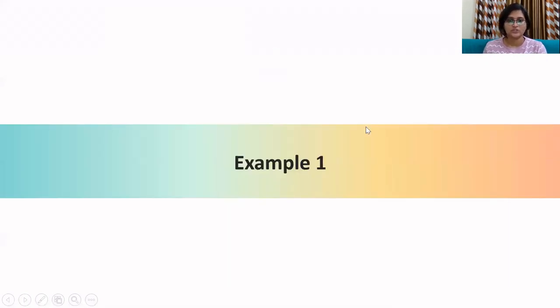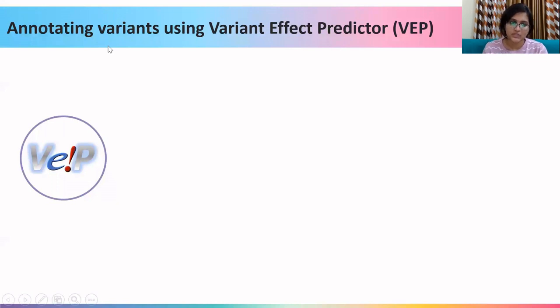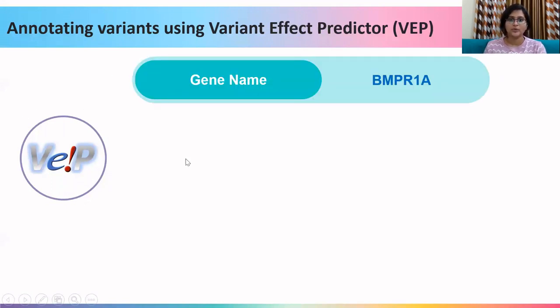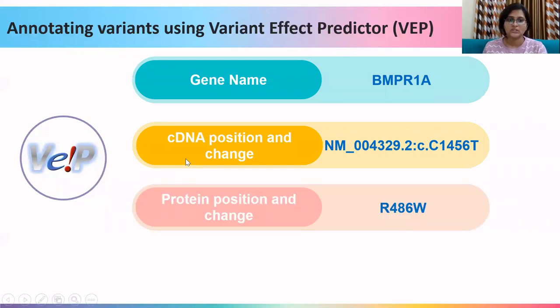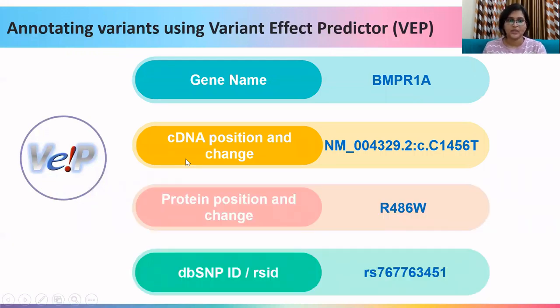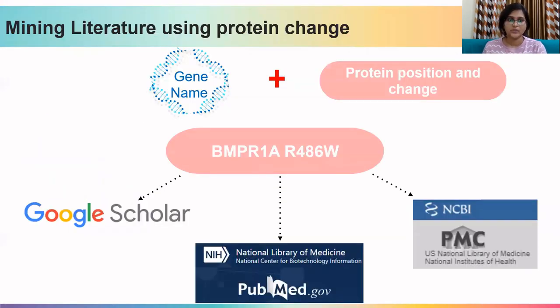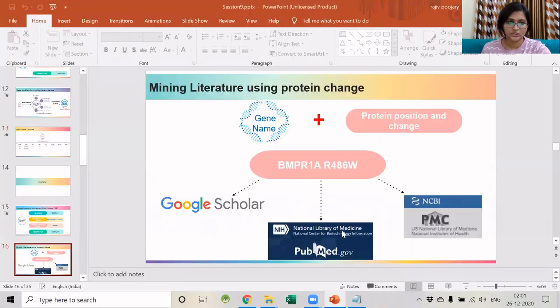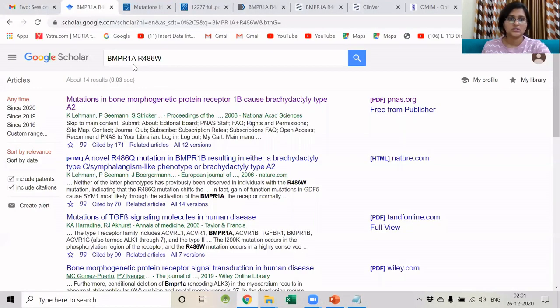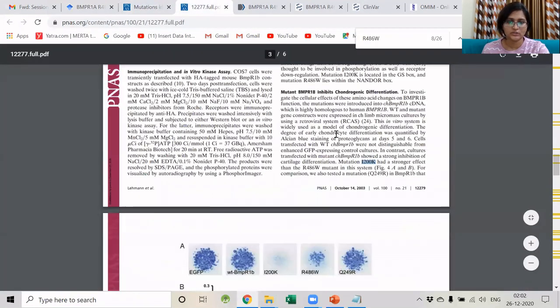Let us look at the first example. I processed the VCF file using VEP and obtained the gene name, the cDNA position, the protein change, and the RSID. For annotating this variant and mining the literature, I need to use the gene name along with the protein change and position. I will first use this information to search on Google Scholar. As you can see, I found about 14 results — 14 articles mention this particular variant. I will open the first link and use the PDF link to open the full text of this article.